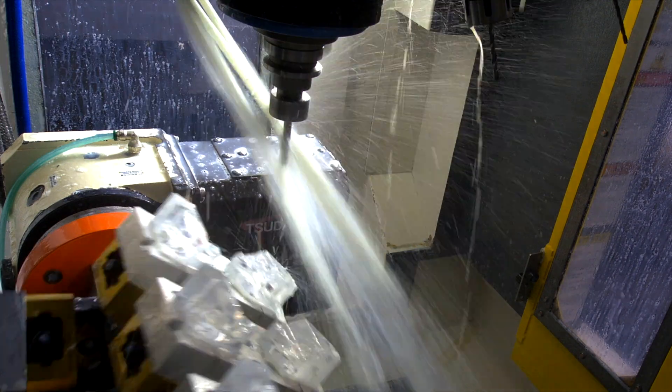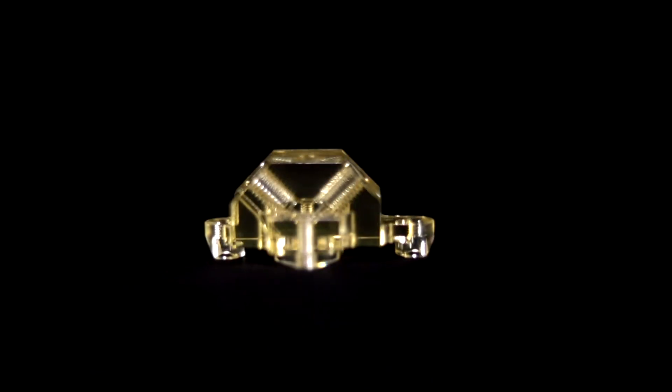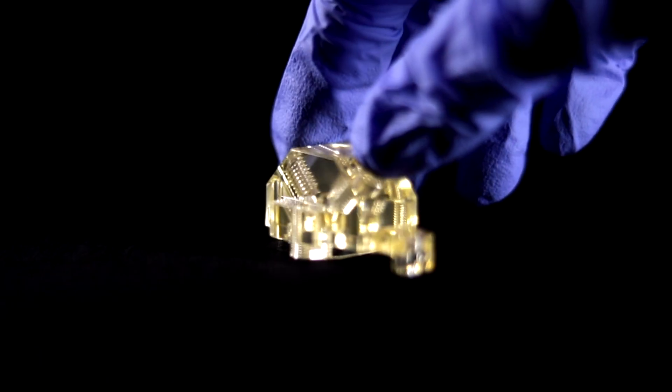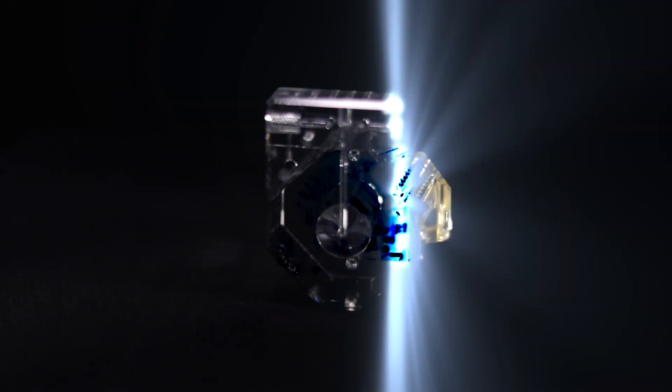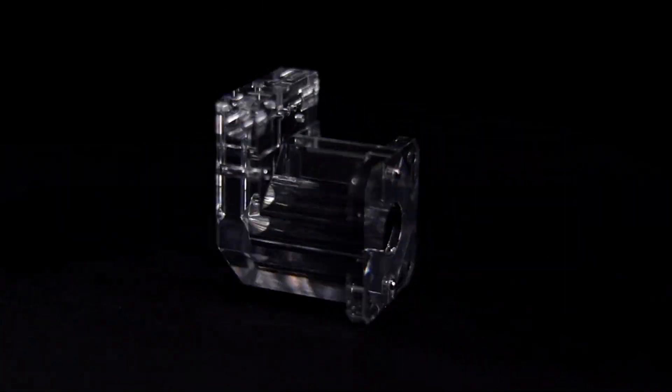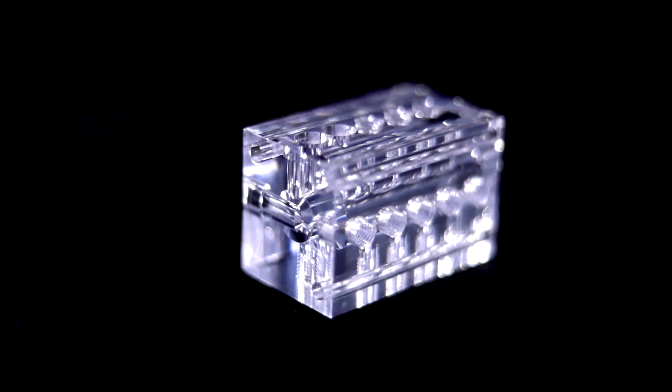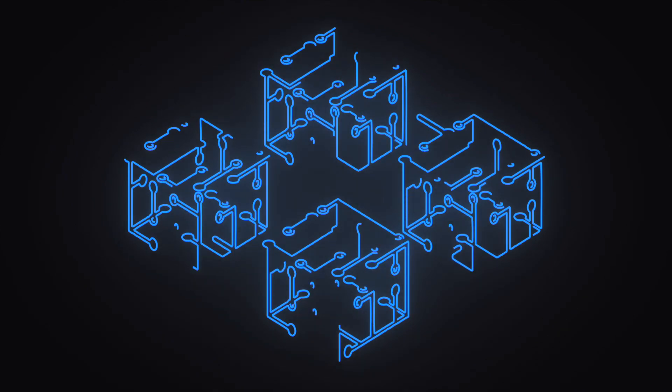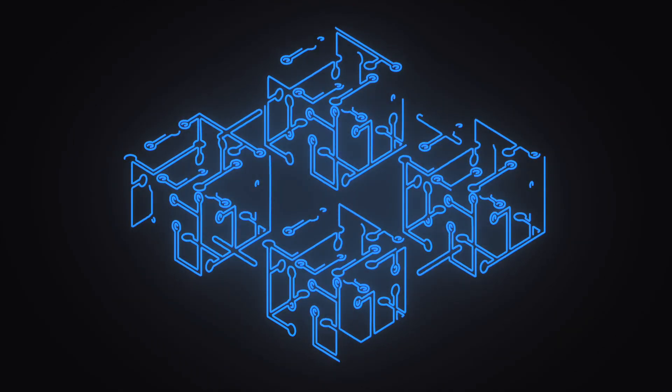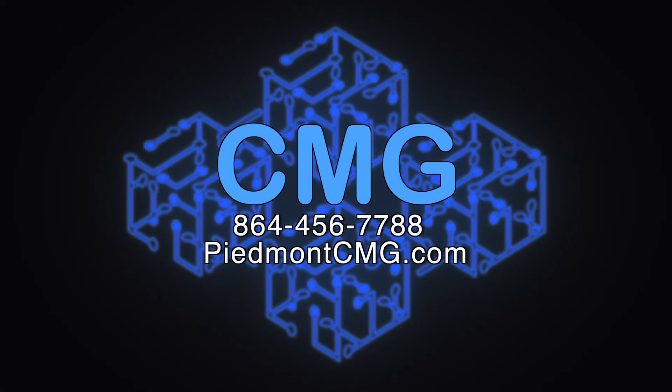Contact us today and find out how your design, prototype, or production project can benefit from our plastics machining and fluidics expertise. Or, come see us for yourself and discover why there is no one quite like CMG.